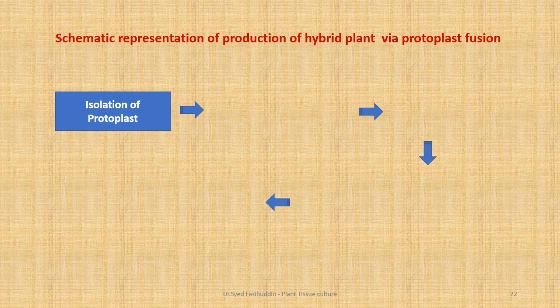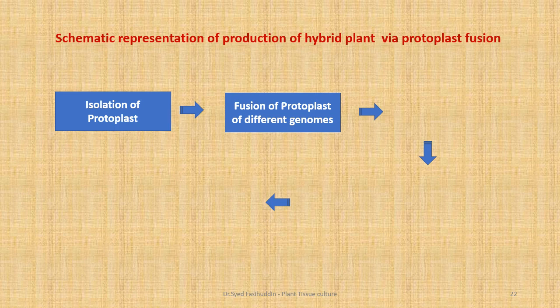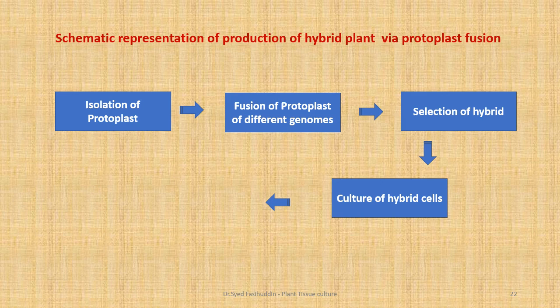Isolation of protoplast. Fusion of protoplast of different genomes. Selection of hybrid. Culture of hybrid cell, then obtaining hybrid plants.